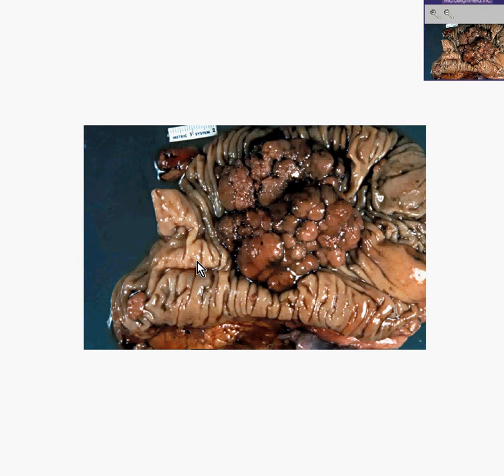This is what a very classical colon cancer looks like. You could see the normal mucosal folding all throughout here, but in the middle we have a tumor that does not look like flat but folded mucosa — it looks like a proliferation of epithelial or glandular tissue. This is absolutely classic for what almost every colon tumor looks like.